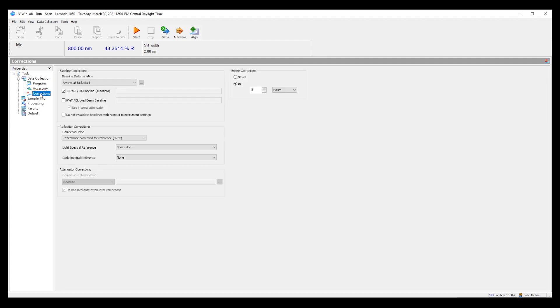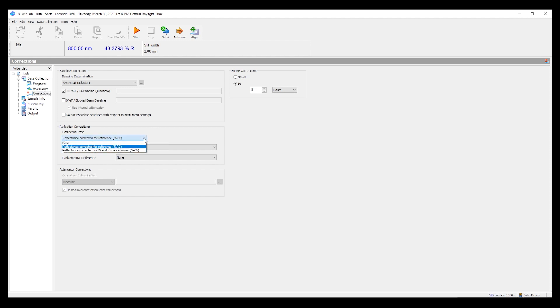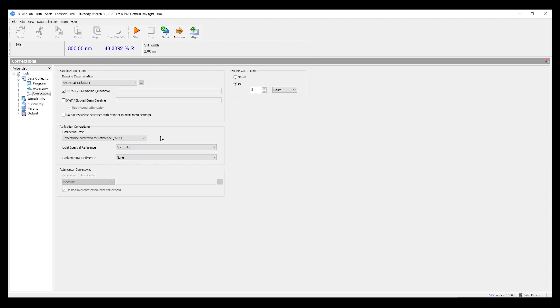And then under corrections we need to tell the software what the Spectralon puck material was. So under correction type here we say percent RC and then we can actually designate a default file for Spectralon.